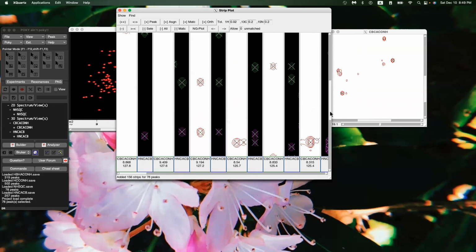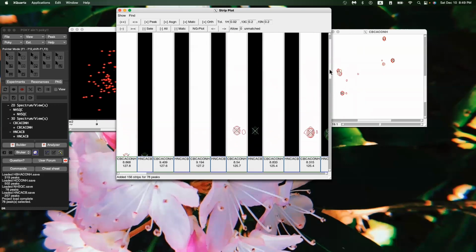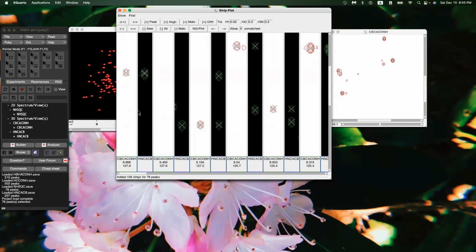So those were our I-1. So let's look at our I. There's one right here. And then, nope, just this one right here. So meaning that our second I residue peak must be overlapped here somewhere. That's okay. And so we're done with this pair.